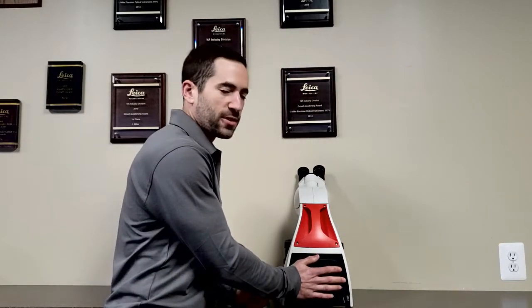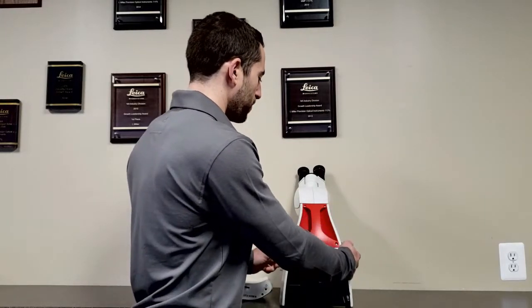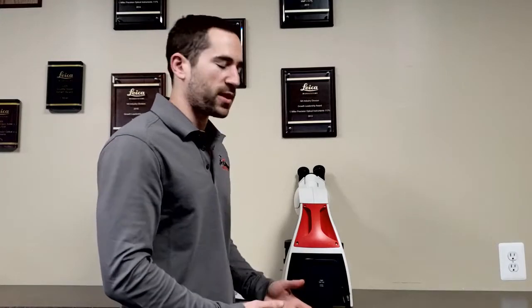Three, the microscope has an integrated carry handle for safe transportation. Four, the microscope has an integrated cord wrap. Five, the frame of the microscope is wide and flared out, which protects all moving parts of the microscope when putting it away.